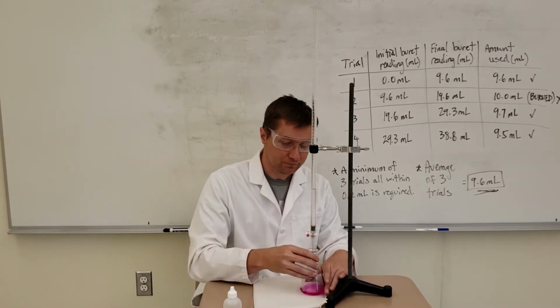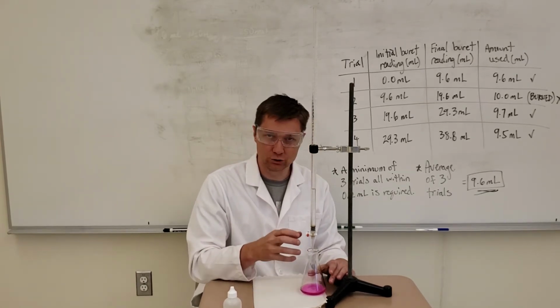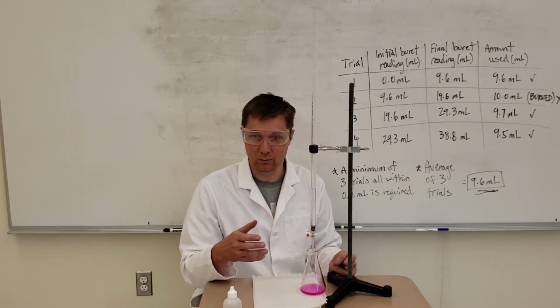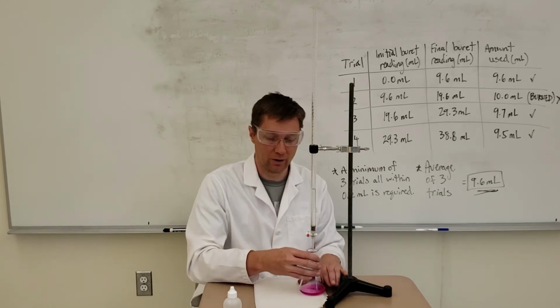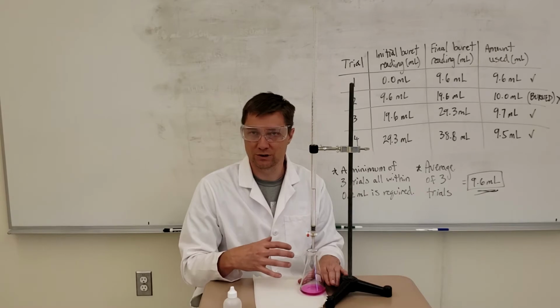And so you've got to add it gently and slowly, one drop at a time, so that you don't burn the solution. I'll be right back with one that doesn't look burned, but that's what a burned solution is going to look like. I'll do one more example of myself doing it a lot more slowly to show you what the persistent pink looks like.